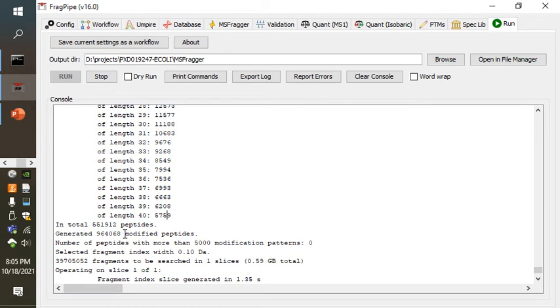But one of the things I'm very grateful for is that the number of fragments that we need to compare to this can all be handled in one slice of RAM. The computer is going to load a whole bunch of this database index into RAM and process each file in one pass.